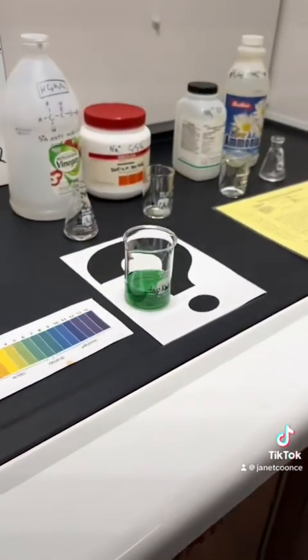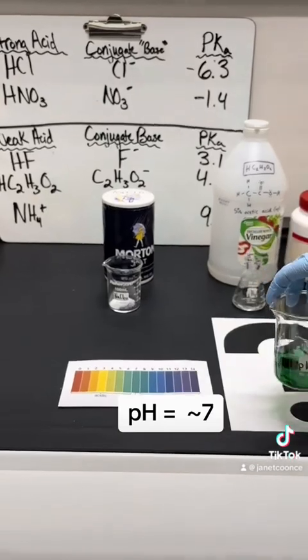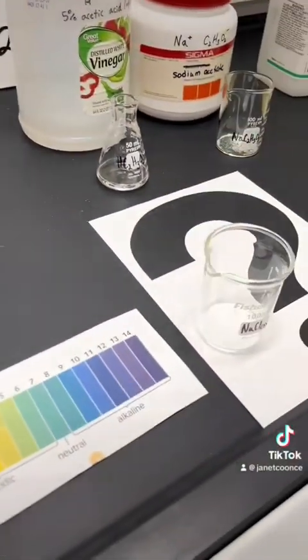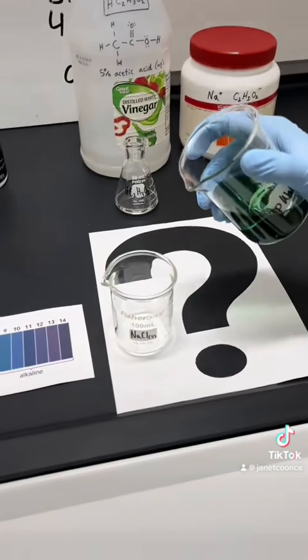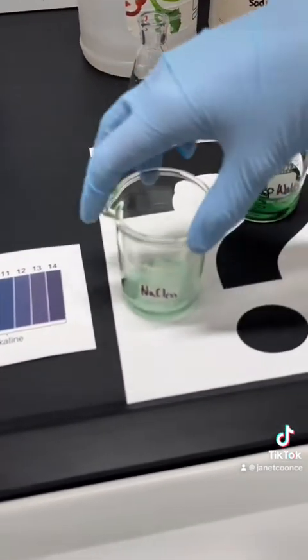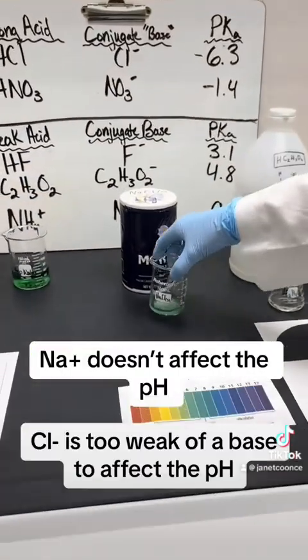So here we have some tap water, and as we can see, water is neutral, and so that is why we have this green color. Now, let's see what happens when we have the table salt, sodium chloride. Let's see what happens when we use tap water with sodium chloride. So will the pH change? And it's still green. So still green, it's still neutral. Sodium chloride does not change the pH of that solution.